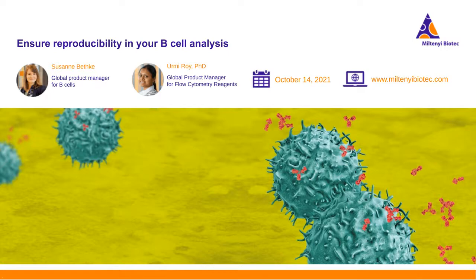All right. Next question. Can you sort antigen-specific B cells with your system? What are the purity and viability?